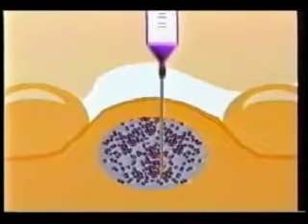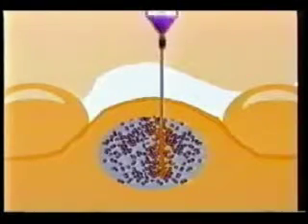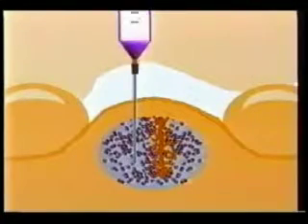If there are many smears with a lot of material mixed with blood, there will probably not be enough time to smear everything before clotting occurs. Therefore, it is important to pick the most promising material first and make at least 1 or 2 good smears. If the material has already clotted, one may make a few smears and fix them in alcohol for better translucency than air drying. A cell button may also prove productive. Then repeat the thin needle aspiration biopsy, if possible, in a different part of the target where bleeding and clotting has hopefully not already occurred.